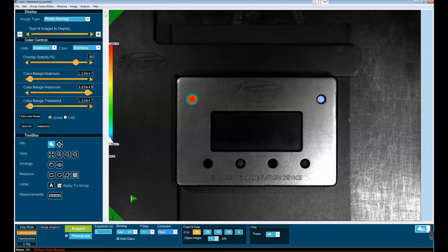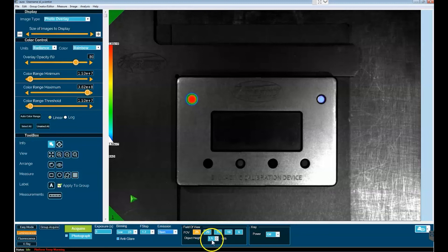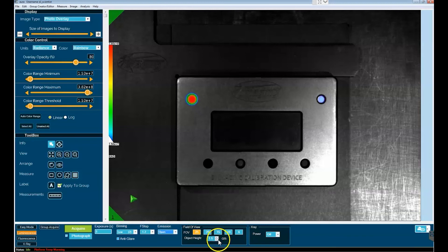Below all these FOV options is the object height. Object height is making reference to the height of your object, and that is typically going to be about 1.5 centimeters for your average mouse. If you are imaging rats, you'll want to increase this value to about three centimeters. In general, measure the height of your object and put in that value here for object height. This will allow the focusing of the camera system to be optimized to the point at which light is released from your target object.